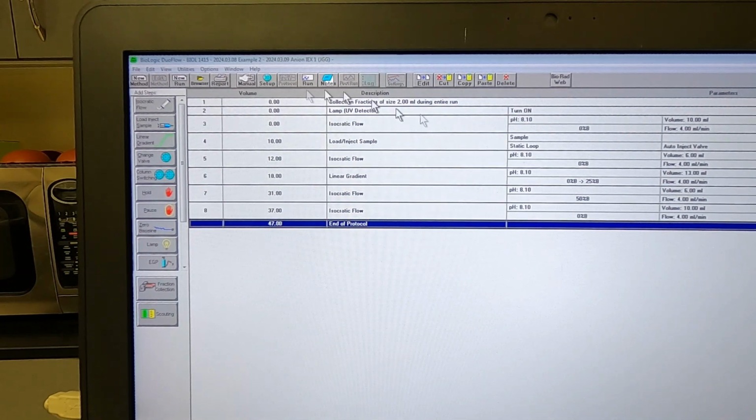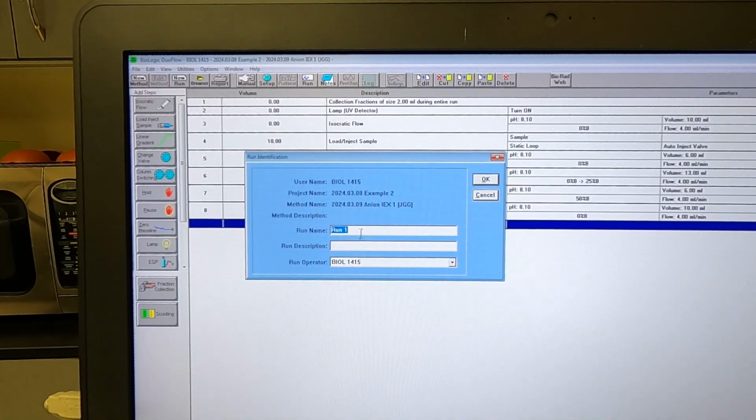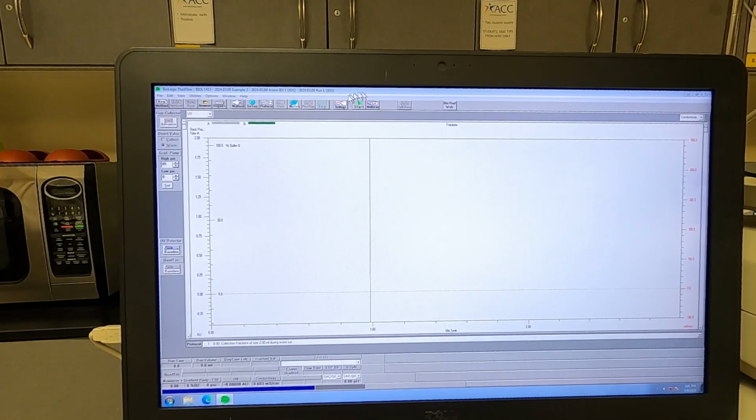So that is our final protocol here. Now that we're ready, we can run our sample. It's going to open a new box. Again, I recommend putting the date, and then run 1. And I'll put my name or initials here, and then I'll push OK. You'll also notice there's a green start button here at the top, so we don't want to push that yet.